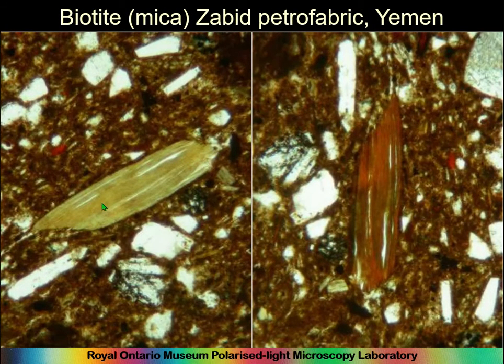So here we have the perfect cleavage of micas. And so you can see it's just completely going cleave crazy here. You can make a sheet of biotite as thin as paper, or thinner, actually. And so it's very easy to cleave, and you can see that this structure is very cleavable and very, very perfect.